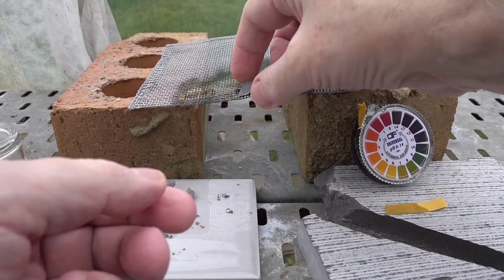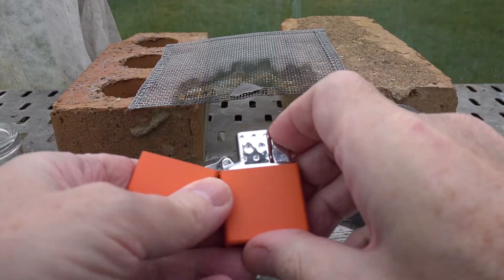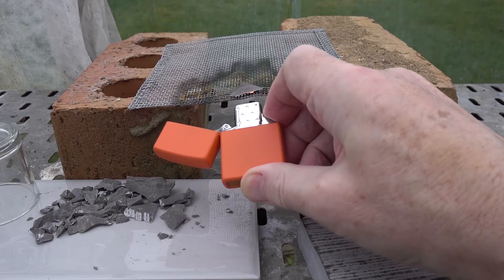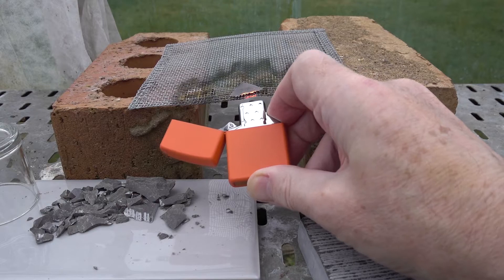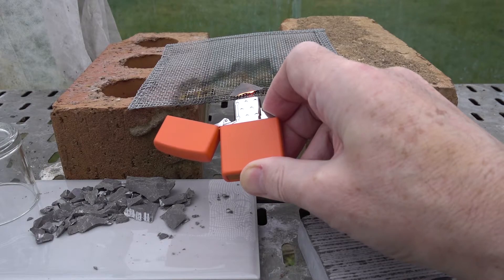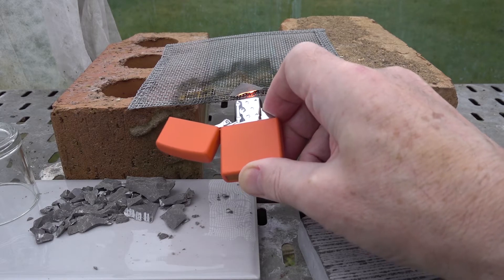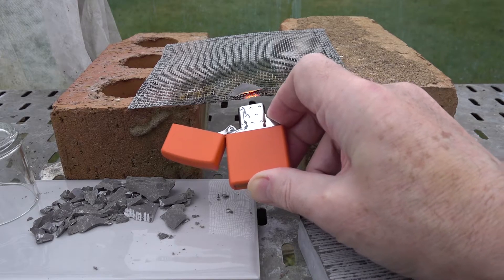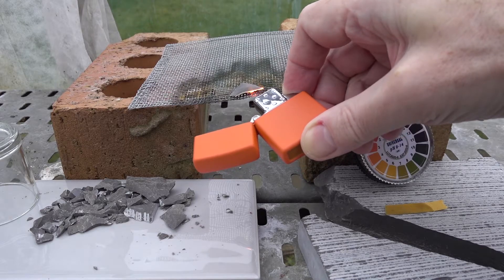Now, taking another thin sliver of limestone and placing it on the edge of the gauze, we're going to see what happens if we heat the limestone. Here we have our burner — let's heat it. You should be able to see the edge of the chip glowing quite hot. Let's try heating from the top and side as well.